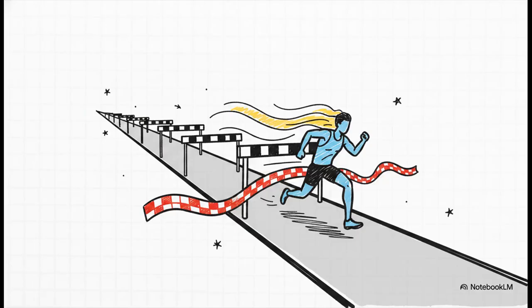First up is the void time, or V time. You'll actually sometimes hear this called the dead time. It's the time it takes for a compound that is completely unretained to just wash straight out of the column. Going back to our analogy, this is kind of like a runner who completely ignores all the hurdles on the track and just sprints straight from the start line to the finish line without being slowed down at all.